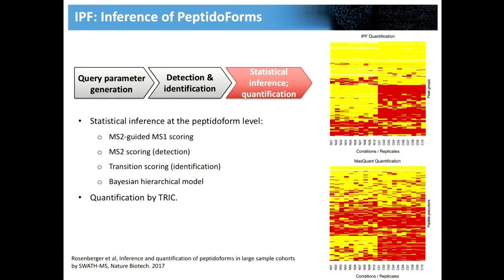I mean, maybe it's worth saying that this is DDA data from triple TOF, right? Which may not be completely optimal for MaxQuant, although they say it's so it's not only the comparison between the softwares, but it's also the comparison between the DDA and the DIA data, right? There's more than one variable in there.